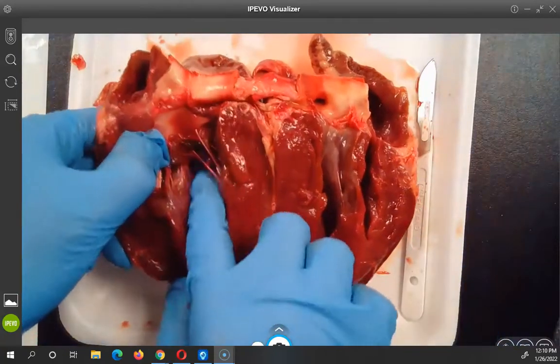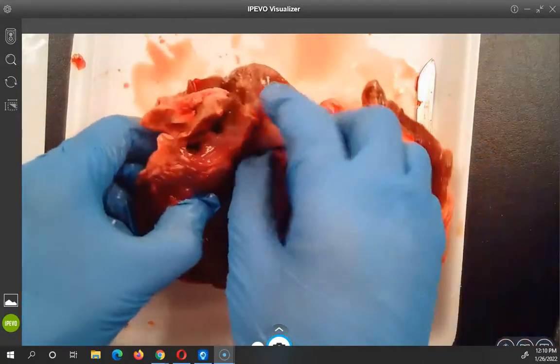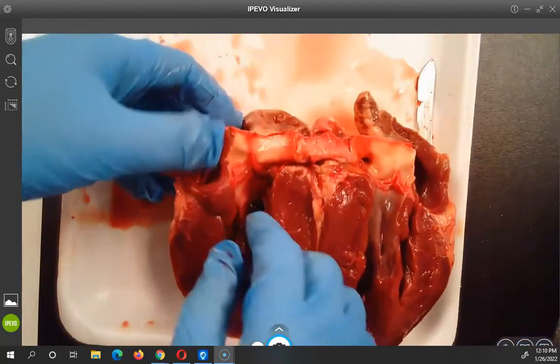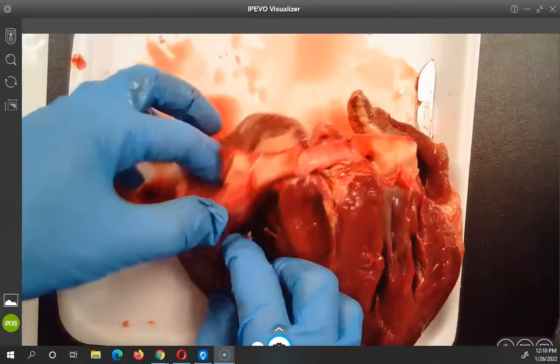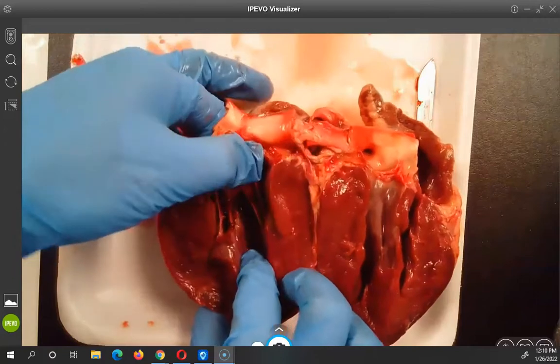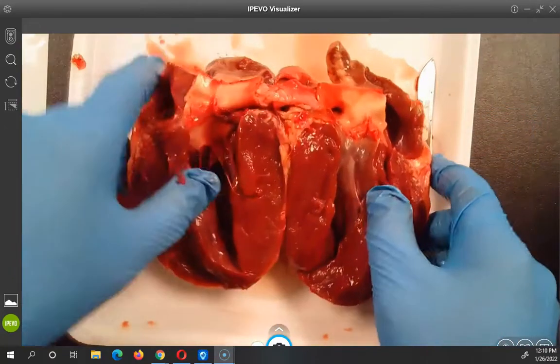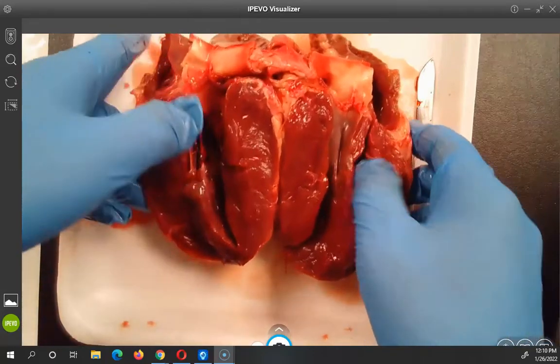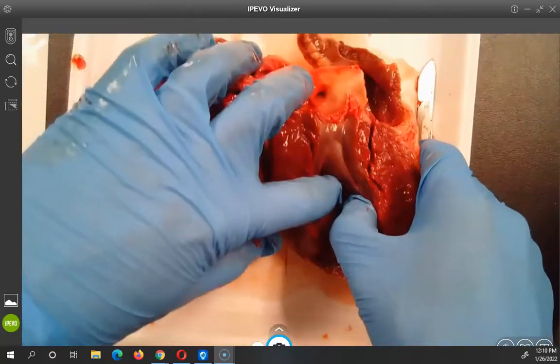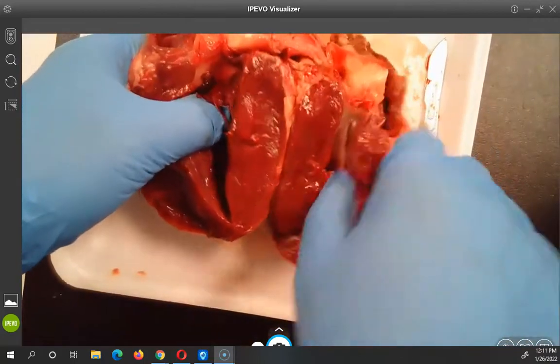It's cool to get to see it live — meaning not recorded. I just needed one. It's like a dense steak.